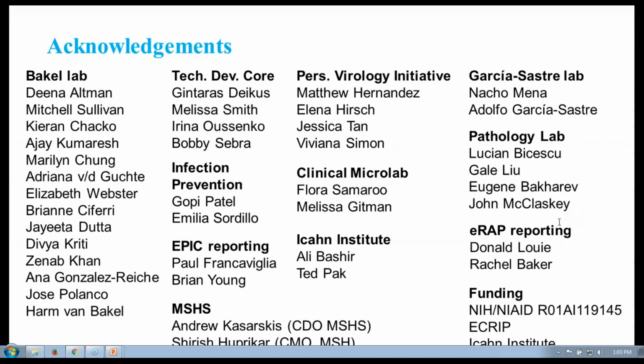So the first one for you, Ben, is at the UMGC, do you have a PacBio protocol for fungal genome sequencing with or without multiplexing? Yeah, we do, and it's essentially going to be the same protocol. With multiplexing, we might do something very similar to this for the microbial multiplexing, or if we're running a singleplex, we might try to go for a slightly larger insert.